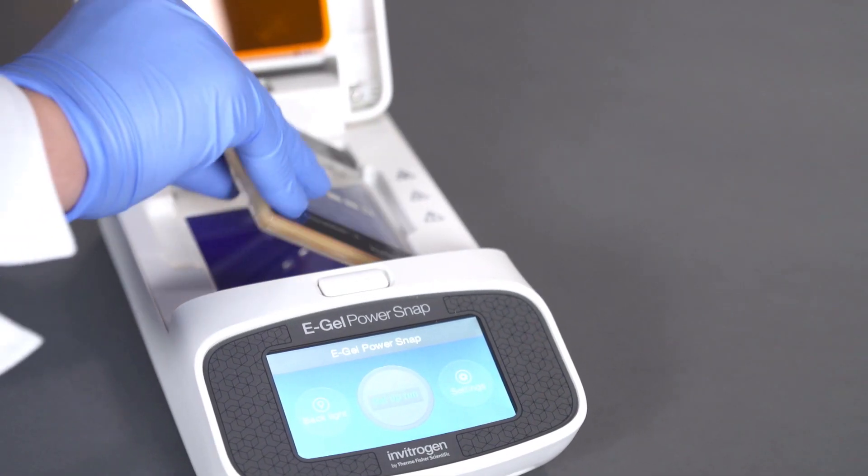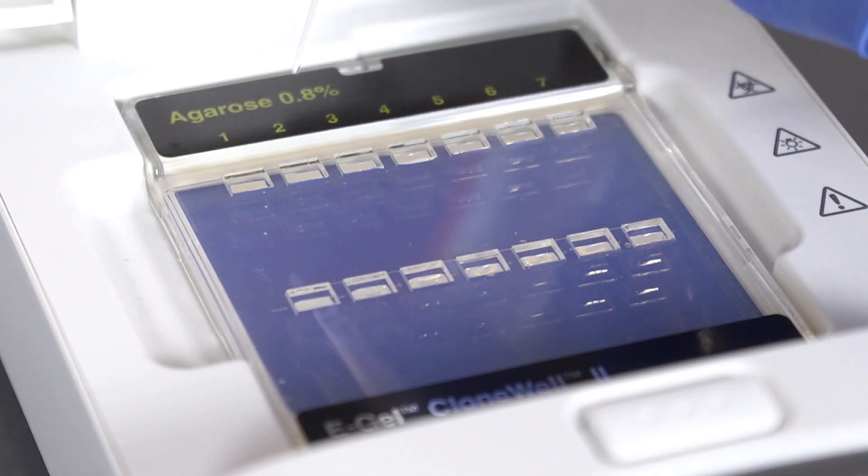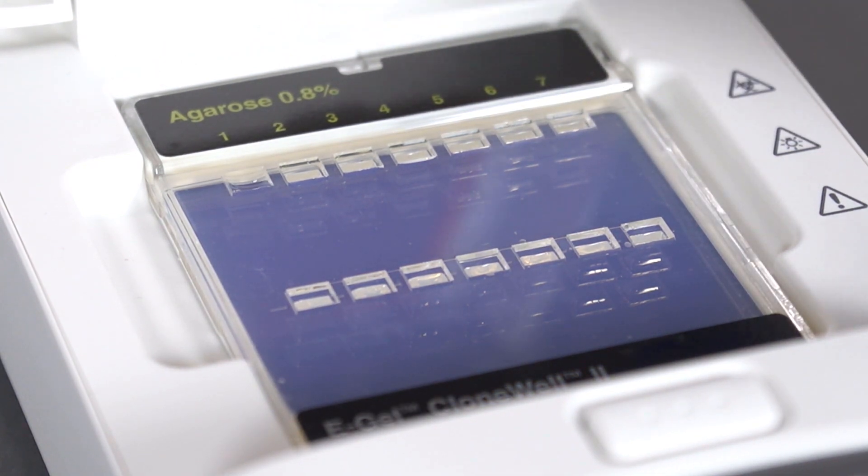Insert the eGel into the device and fix the cassette by pressing lightly. Pre-fill all wells with 50 microliters of deionized water.